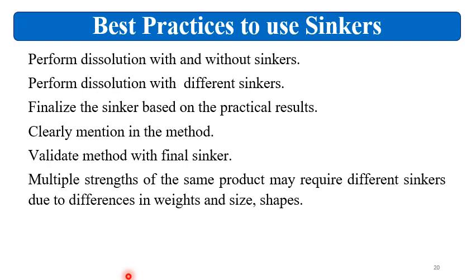Whichever sinker is giving you uniform loading, whichever sinker is showing very little variability, whichever sinker is showing good hydrodynamics, these sinkers can be used. Then clearly mention the use of sinker and type of sinker in the method. Use clean and correct weight sinkers every time. Then validate the method with the final sinker and mention it clearly.